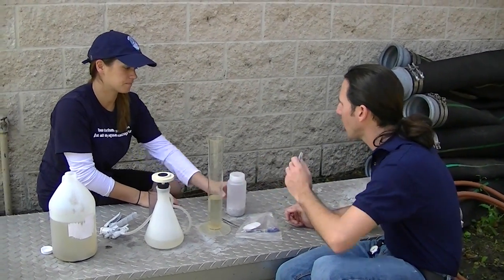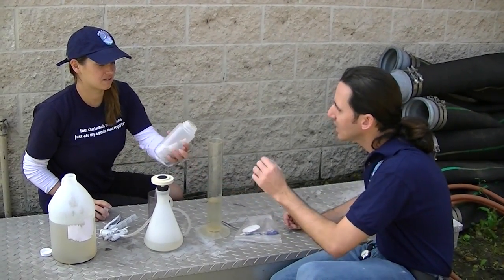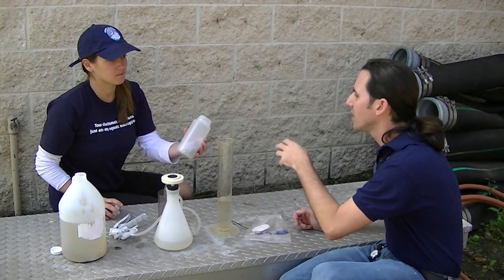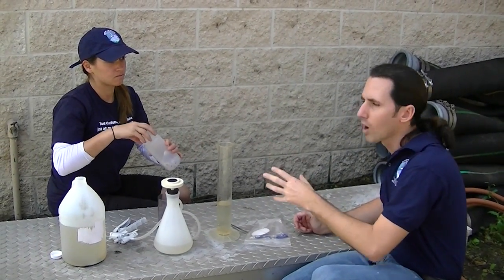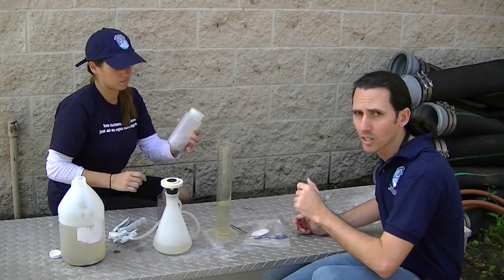Now we're going to put it in our bottle of desiccant. Desiccant are these little crystals — they basically absorb the water so it keeps the sample drier. You can use one bottle of desiccant for all the samples that you take on the lake.